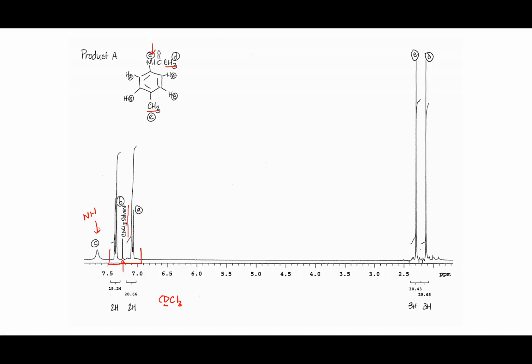So in terms of assigning the doublets in the benzene ring, we've now gotten to a point in lecture where you've talked about electron donating groups and electron withdrawing groups. Well, now we can actually tell which doublet goes with which. Electron donating groups cause the doublet to be shifted to the right, to a lower chemical shift, whereas electron withdrawing groups push to the left.